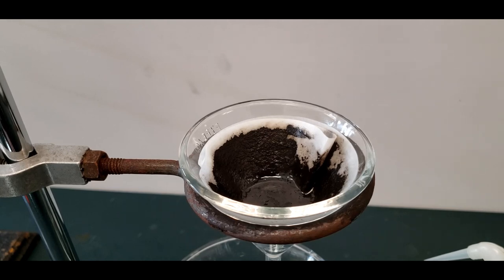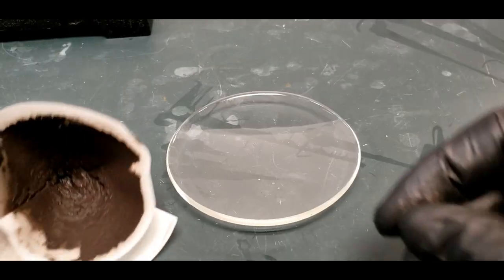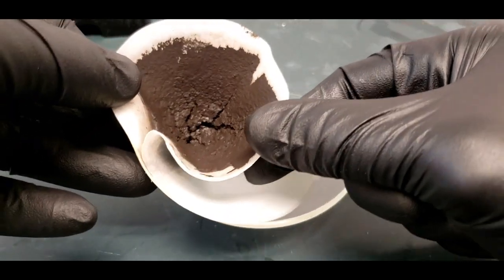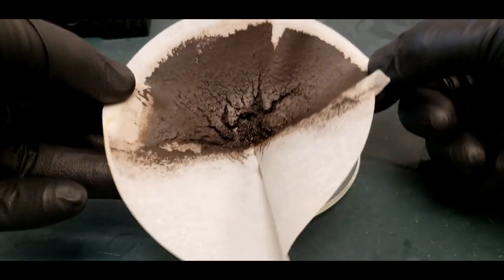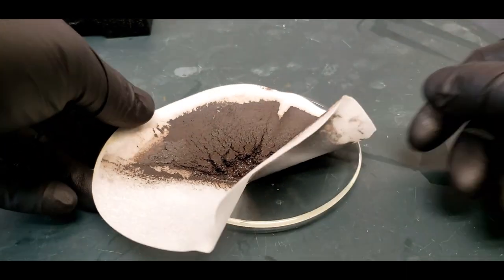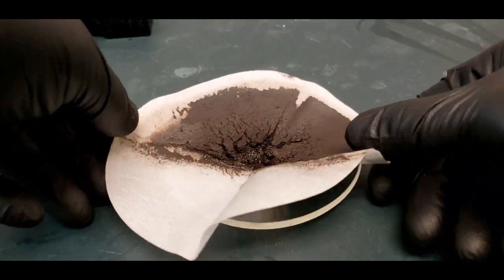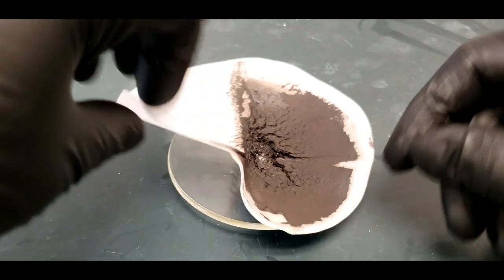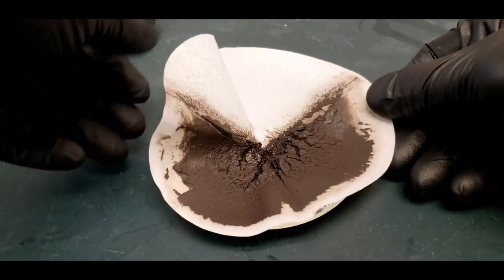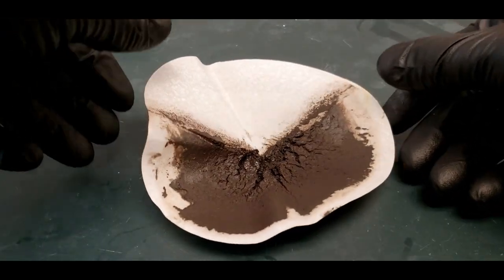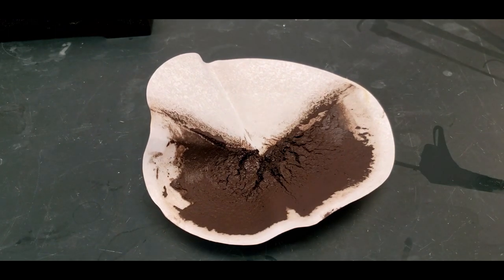On top of that, the ethanol and the acetone both are really volatile liquid. So they'll burn away or evaporate away very quickly in the oven. So we should have a dry sample within 15 to 20 minutes.